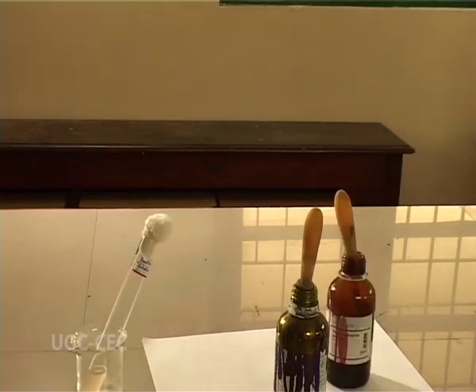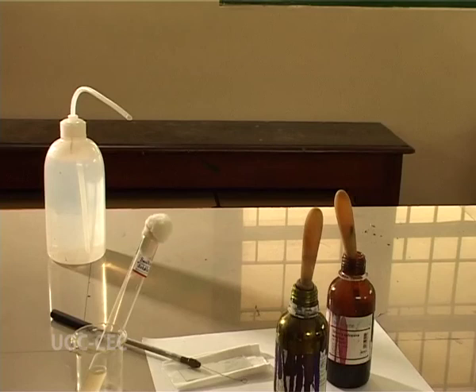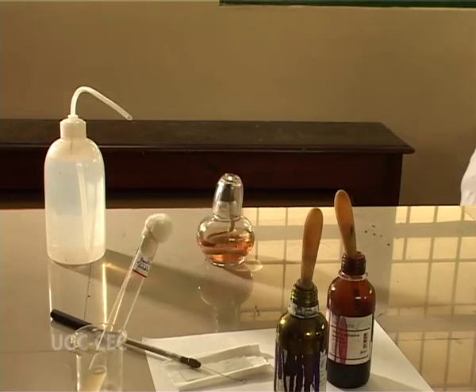We require Bacillus cereus or Bacillus subtilis culture containing endospores. We require the staining reagents such as malachite green, safranin, and distilled water. What else? We require clean, grease-free glass slides, inoculating loop, spirit lamp, blotting paper, microscope.